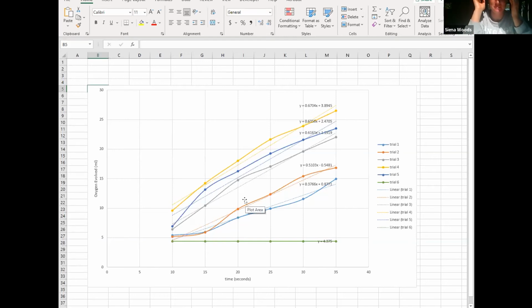I have a question. There's nothing like the osmotic pressure that we saw in the osmometer lab that has to do with the oxygen weighing down? No, nothing like that. I was wondering, could it be that the enzymes in the pH solution have settled to the bottom, and then when you're collecting them, you're not getting as many enzymes towards the end? No, it's a solution. It's not going to be a suspension. So I don't think that would be an issue.